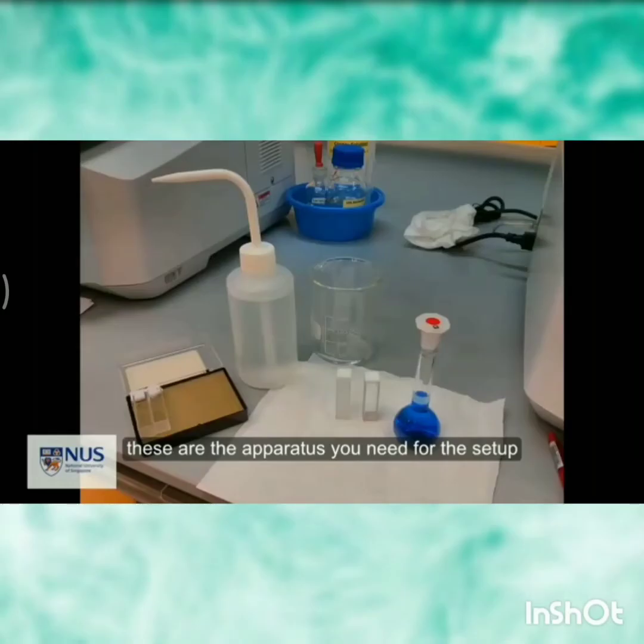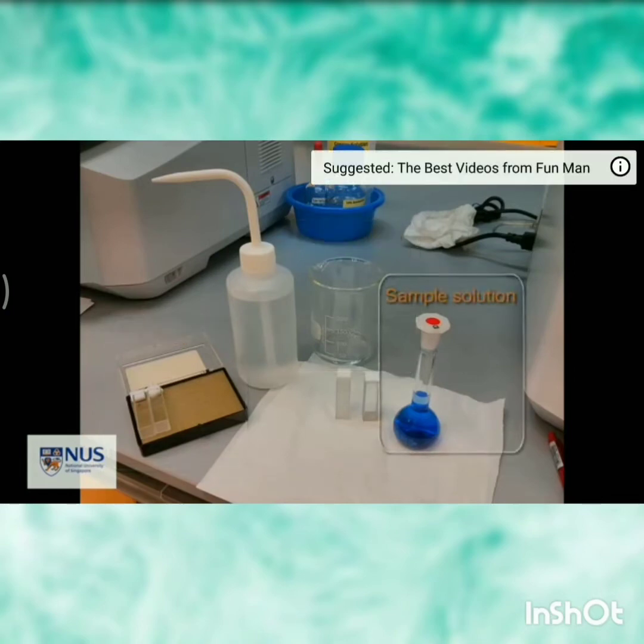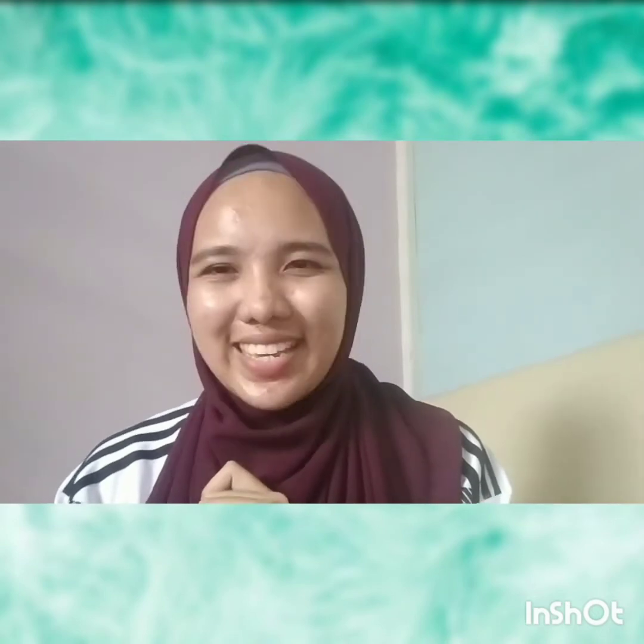Before we proceed with our procedure, there are some apparatus and chemicals that we need to use. Examples of our apparatus are solvent bottles, waste beaker, cuvettes, and also the sample solution. Now it's time for the procedure.